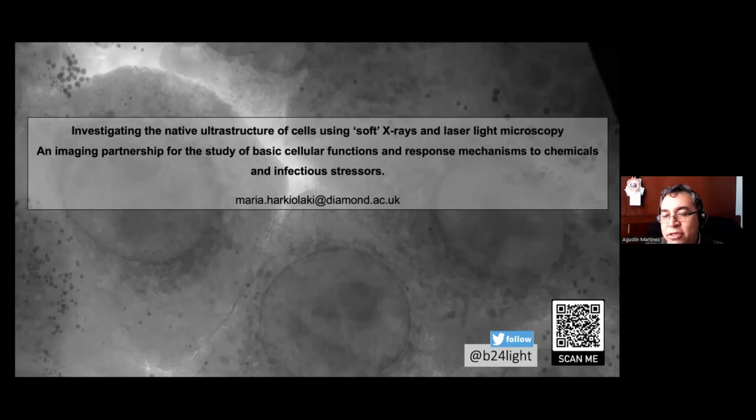Yeah, I understood that, but I thought that one of the challenges of this methodology is to increase the contrast from the very beginning. So I know that you can have the contrast naturally, from the natural properties of the samples. But can you also stain with something, because I know that you have to combine fluorescent microscopy with this. No, I see what you mean. So is it possible at the very beginning to do something like some protein or something? To get the ultrastructure, we hands down do not need to do that.